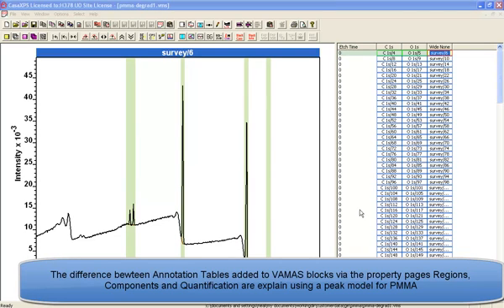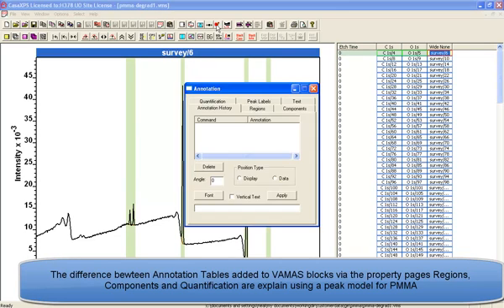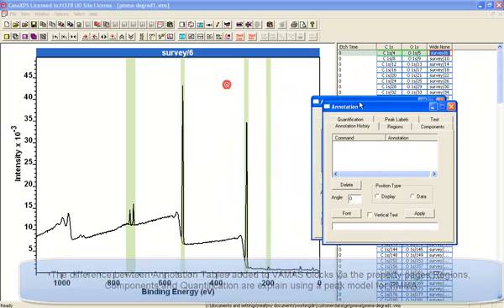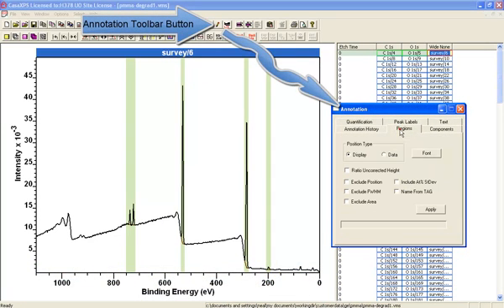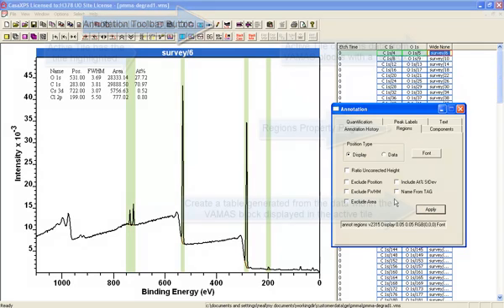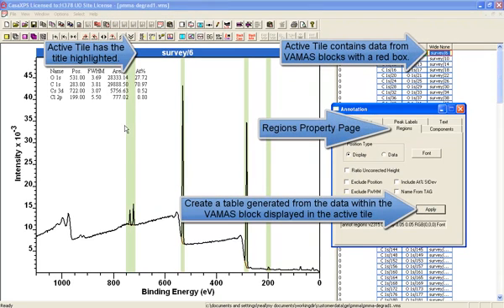Once regions have been defined on a survey spectrum, the annotation property page provides a method for creating a table which is displayed over the data. The data for this table are gathered from the quantification regions on the survey spectrum.